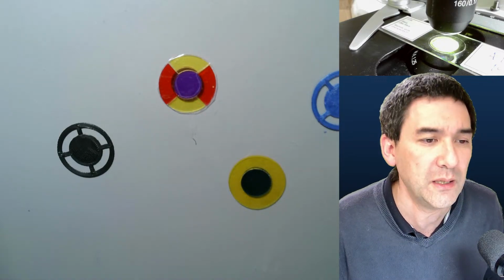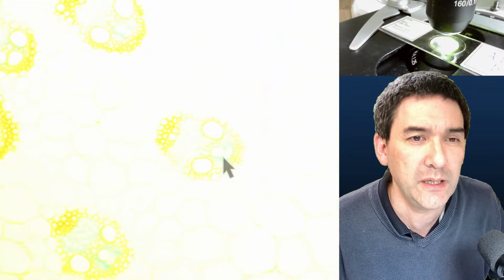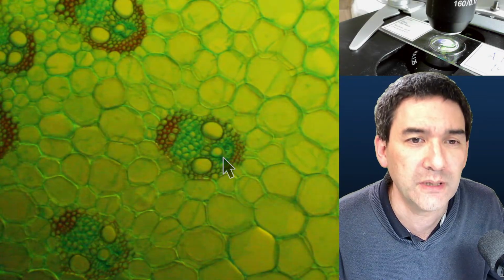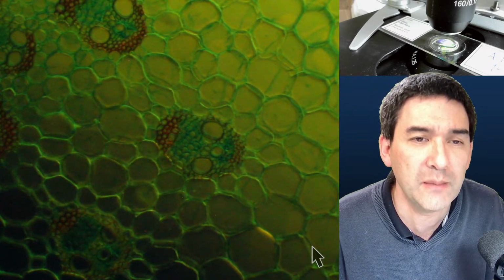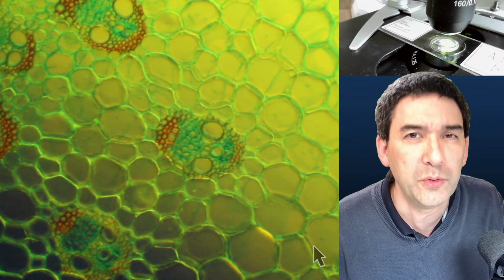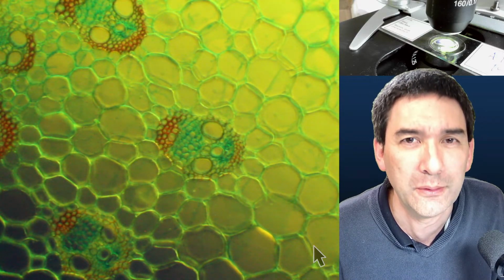I showed you oblique illumination with light from the bottom. But what if I now shine the light from the top? Right now you see that it's from the bottom, and it looks a little bit three-dimensional as well. And I think if you do it from the top, you get an image that looks a little bit more like from a stereo microscope.